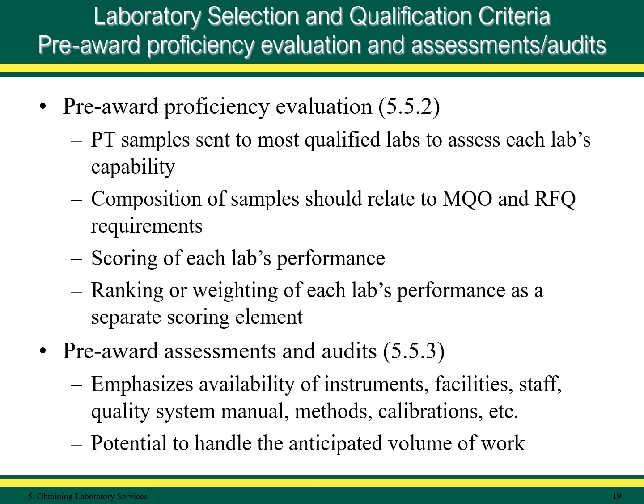Slide 19, Laboratory Selection and Qualification Criteria. Pre-award proficiency evaluations are addressed in MARLAP Section 5.5.2. Some organizations may elect to send proficiency or PT samples, sometimes referred to as performance evaluation or PE samples, to the laboratories that meet a certain scoring criteria in order to demonstrate the laboratory's analytical capability.